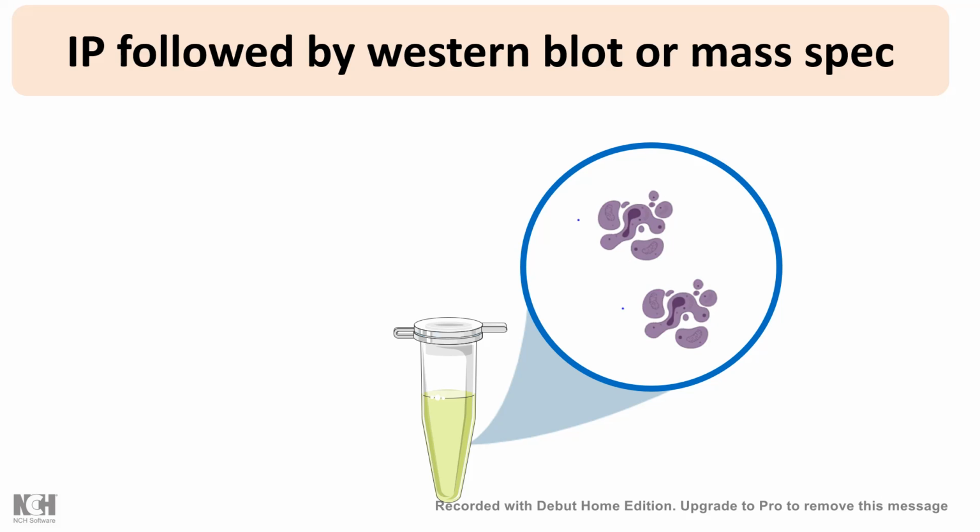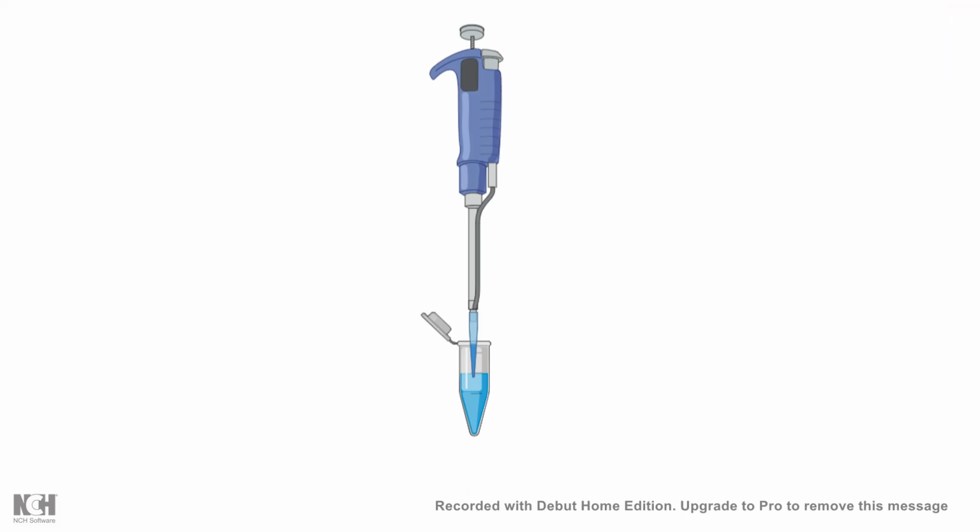And then when the cell has been lysed in the tube, you would be adding the antibody coated magnetic beads. Now these beads would have the antibody of interest for a known protein. Let's say you want to understand whether protein A and B are interacting with each other. So these beads would have the antibodies against protein A because you know in this solution protein A is present. You want to detect whether protein B is interacting with protein A in this solution or not. Then what would you do?